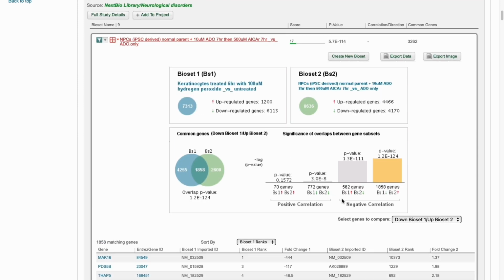You may additionally find value by investigating the specific genes that rank among the most differentially expressed that may be new to you. PubMed is a good resource to find literature to help understand what's known about the gene's function already and to explore why it may be over or underexpressed in your particular study.